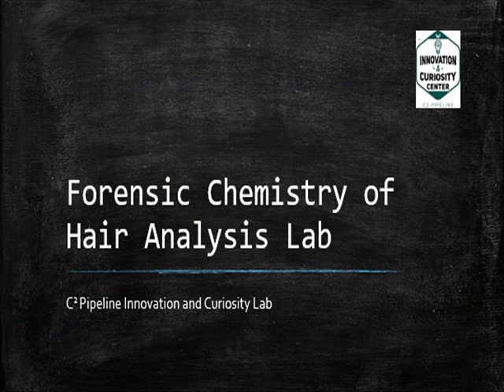At this time, we'll begin our laboratory experiment.